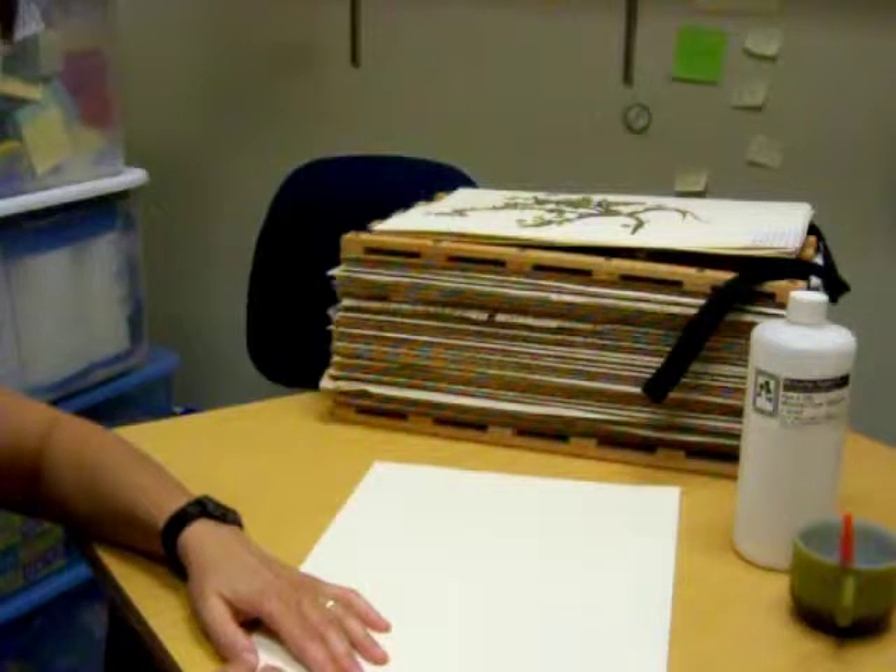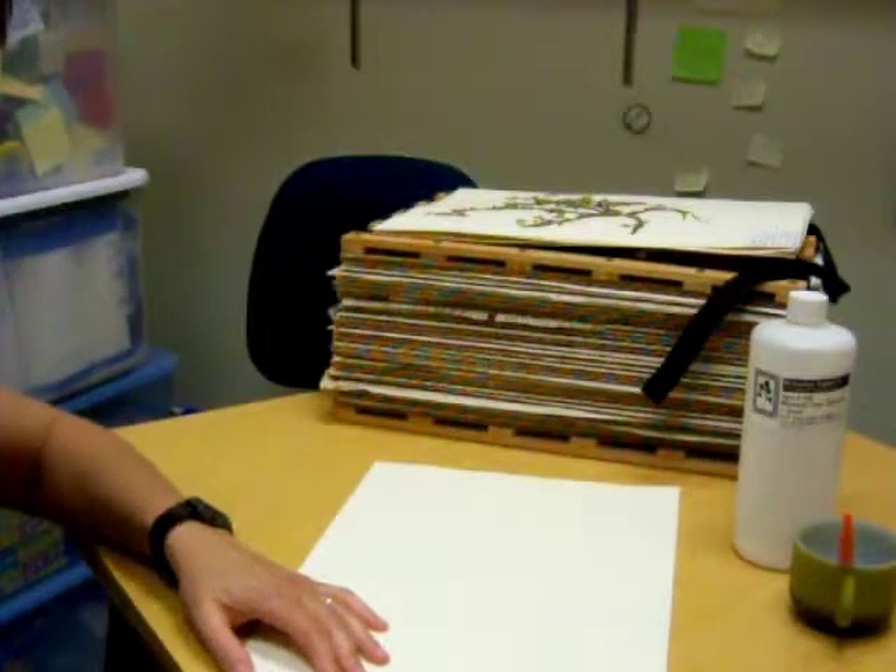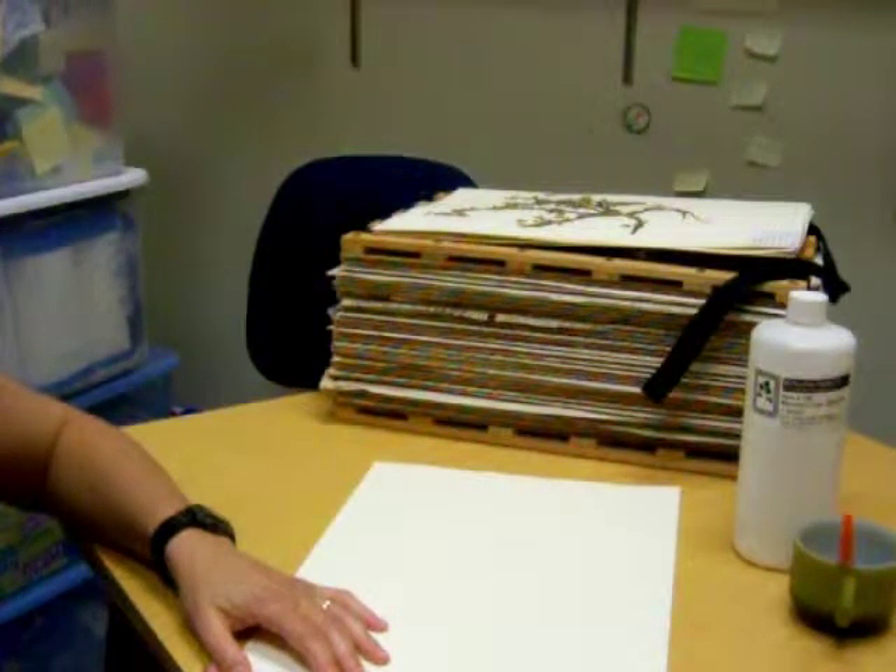The information that needs to be on your label is the genus, the species, and its common name. Locality is where you found it, and those directions should be so complete that someone 100 years from now could walk back to the same spot and find the plant. Then include the date you collected it, your name, and under remarks, a brief description of the habitat.